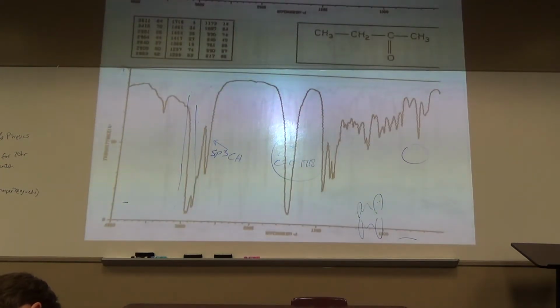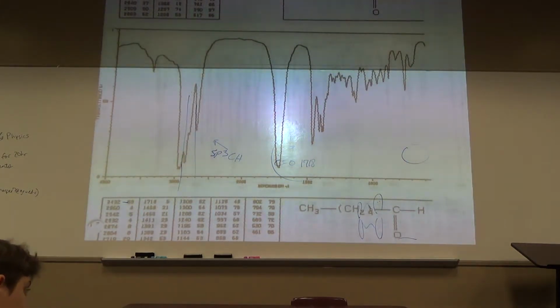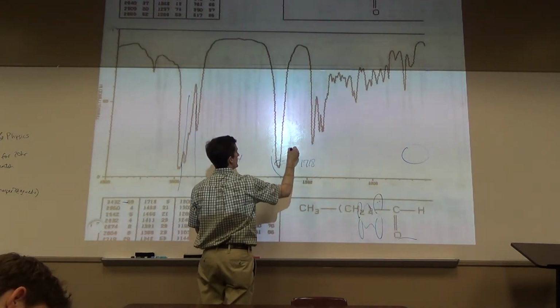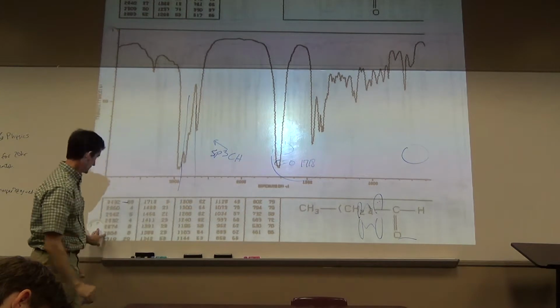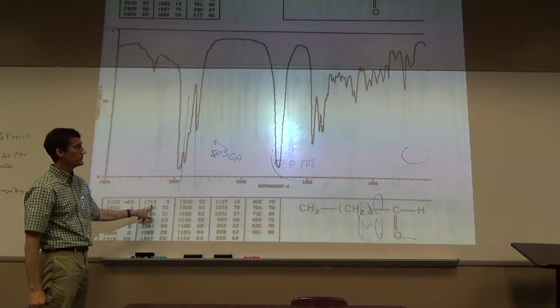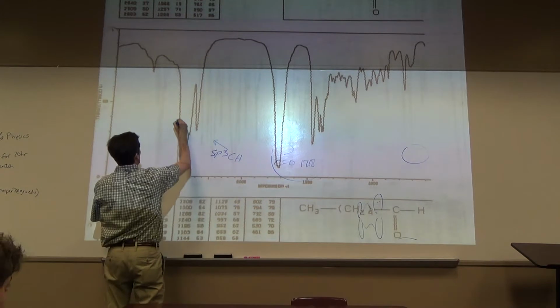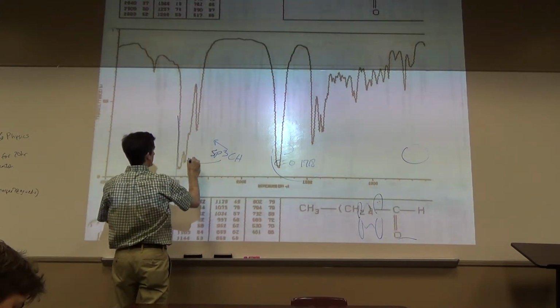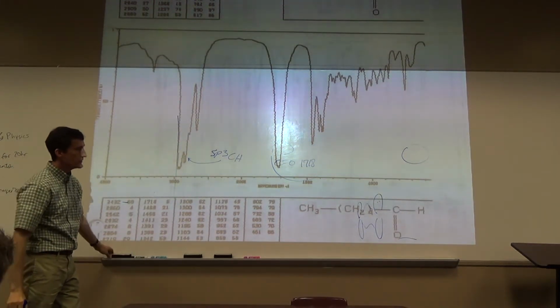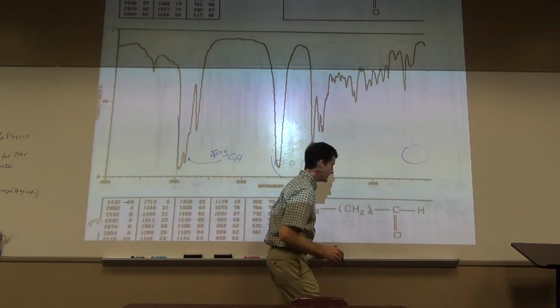What's the functional group below? Aldehyde. Carbonyl, right here. What's the value? It's almost 17, 18 again, isn't it? No, that's just coincidence. We have peaks here, sp3ch. Any other types of CH in this compound?